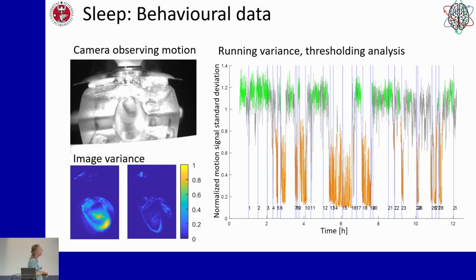Okay, now let me rush to the second experiment I would like to show you, and that is: we want simply to test, do we see bees sleeping, and are we able to see a representation, a neuronal correlate, for sleep in the brain. So you see again a bee under our two-photon microscope. Here's the objective, the head of the bee, the antennas, the abdomen.